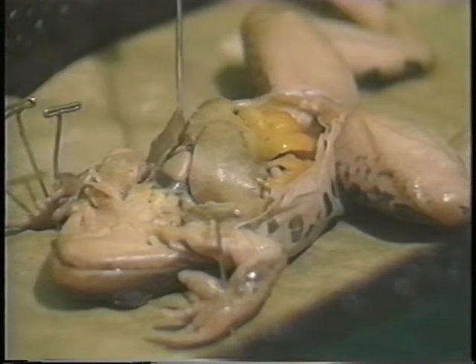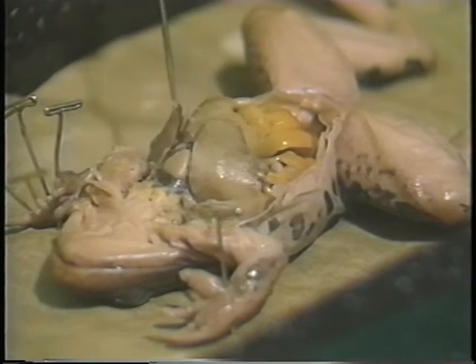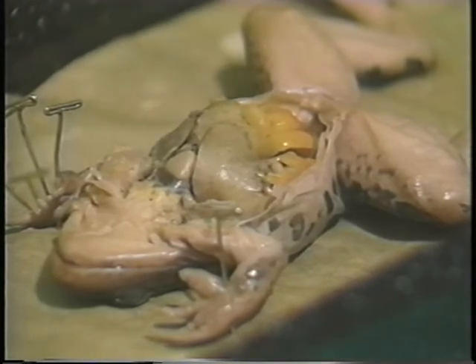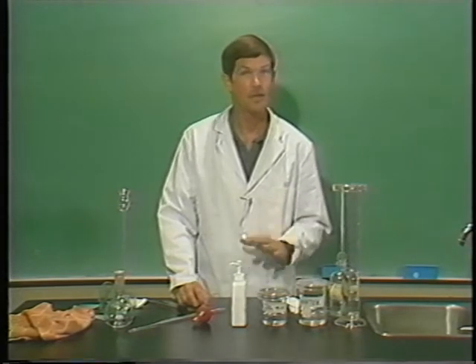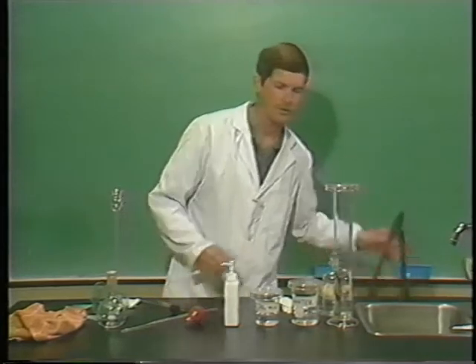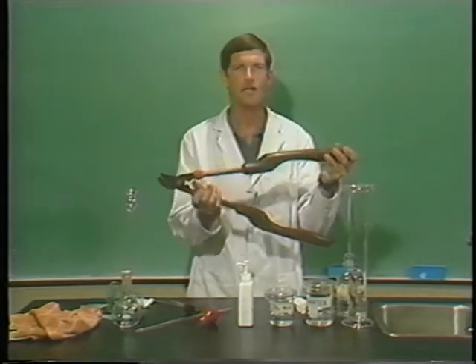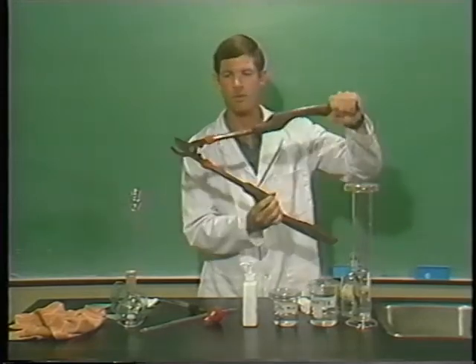You may be dissecting a frog and working with dissecting needles or a scalpel. Be sure that your fingers don't get in the way. And while we're talking about tools, there are lots of tools in the science classroom and at home that can be quite dangerous. Let's take a look at these cutters, for example. There's a great mechanical advantage because of the long lever arm between the fulcrum and where the force is applied. And think of the force that can be applied on these two little cutting edges.